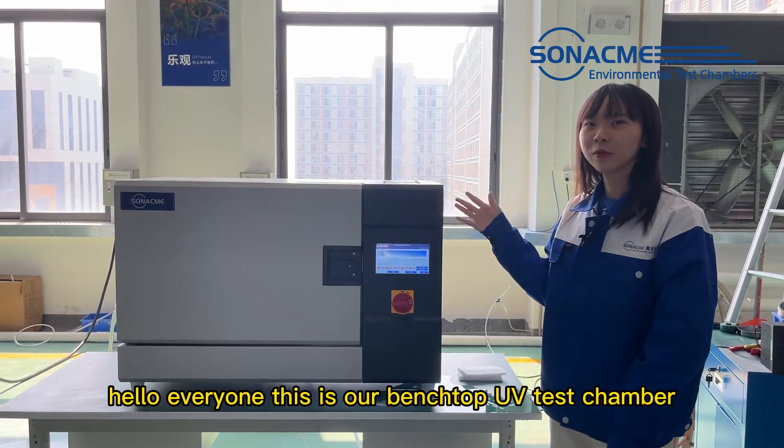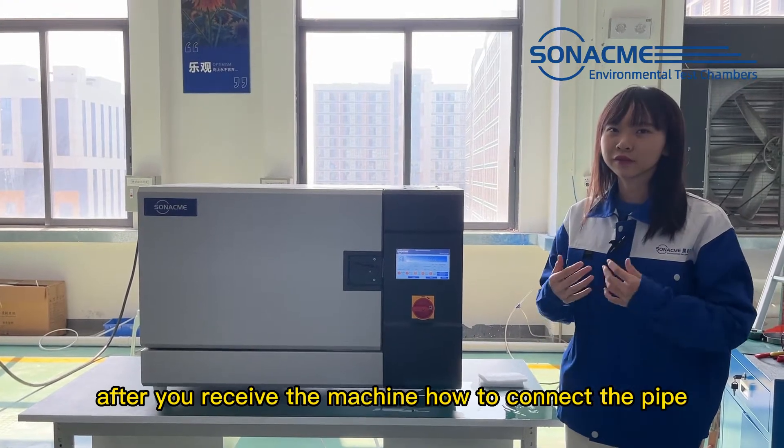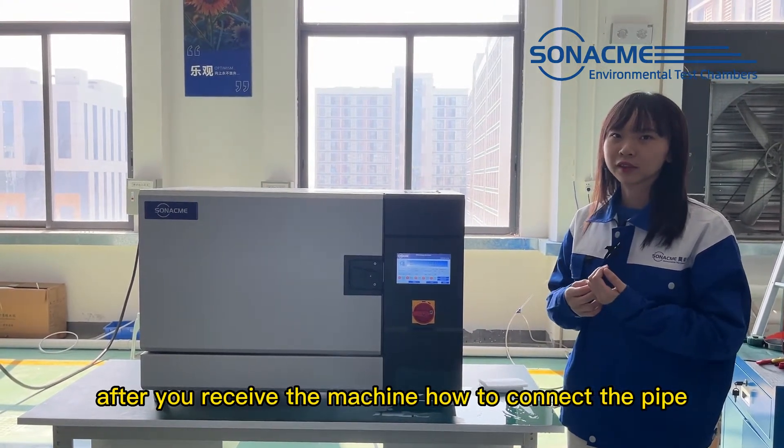Hello everyone, this is our benchtop UV test chamber. Today I would like to show you, after you receive the machine, how to connect the pipe.